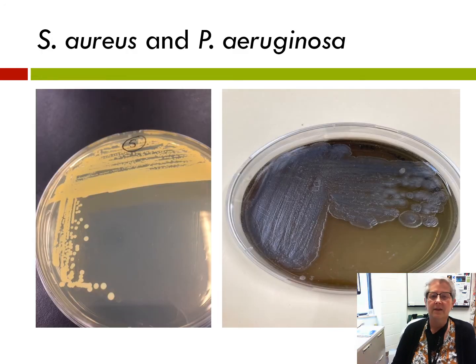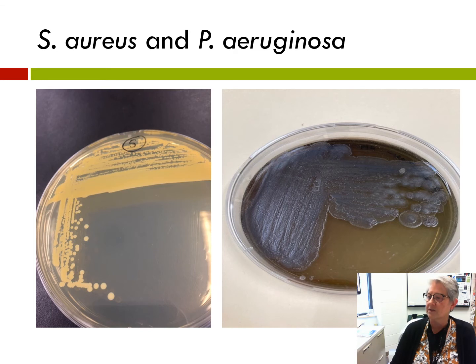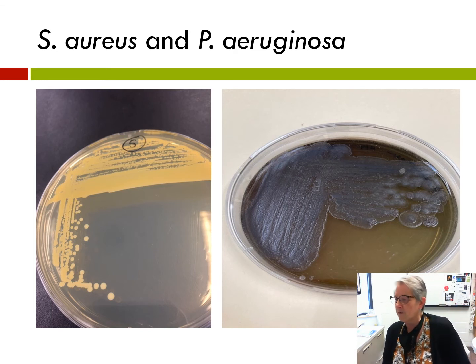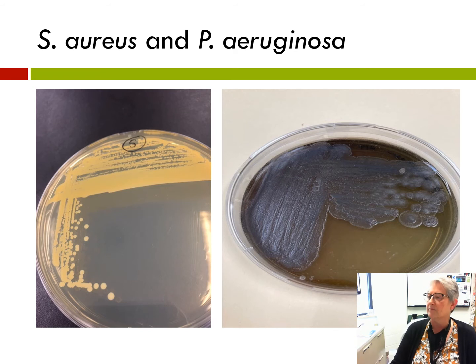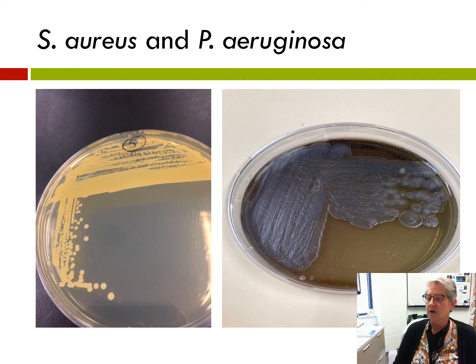These two bacteria have very different colony characteristics. Staphylococcus aureus, or S. aureus, is on the left — it's the yellow-gold bacteria. Pseudomonas aeruginosa is on the right; that's the blue-green bacteria. The Pseudomonas aeruginosa appears more flat, although some colonies may have that umbonate appearance, whereas Staphylococcus aureus has a nice circular, entire colony formation.